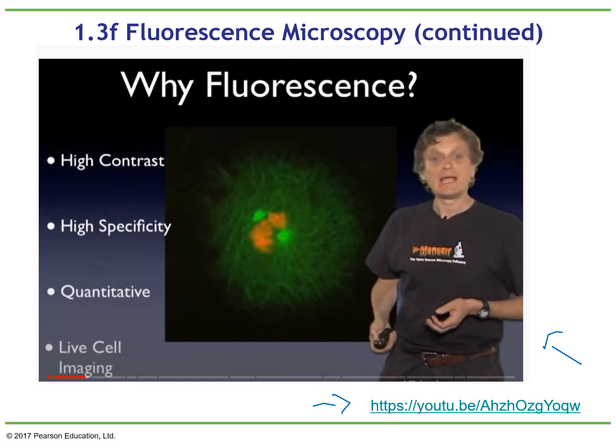Now why do we use that? Because it produces a high contrast. You remember that we were talking about phase contrast and dark field. This one also produces high contrast, but in addition to that, it produces high specificity.